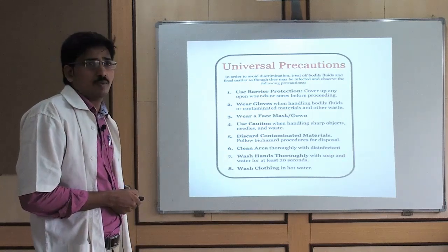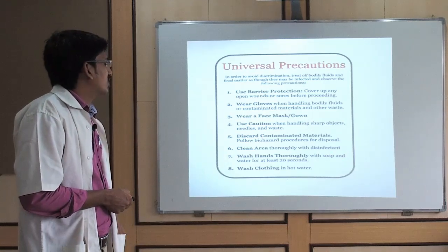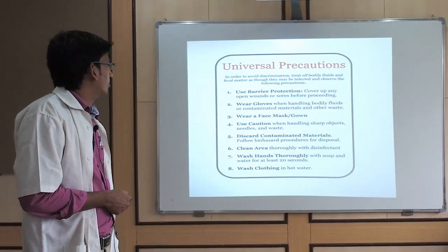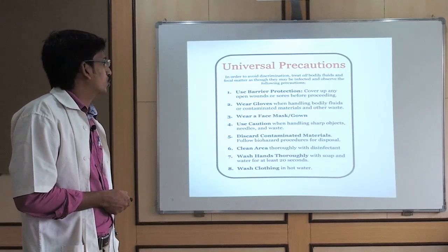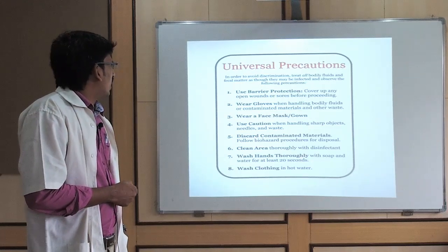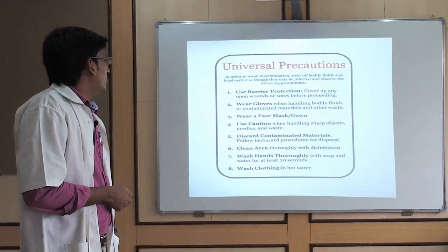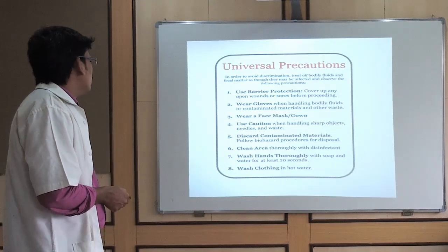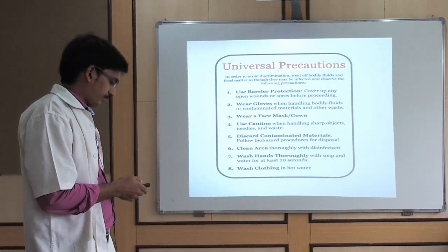If soap and water is not available, then use disinfectant. If disinfectant is not available, immediately call the respective fellow to come and clean the area. Then wash your hands thoroughly with soap and water after your work is over. After everything is over, wash your clothes using hot water. Don't wash your clothes using chilled water or ordinary water.